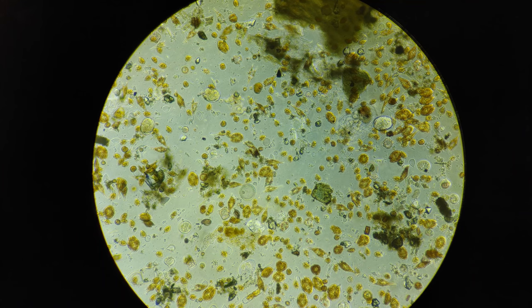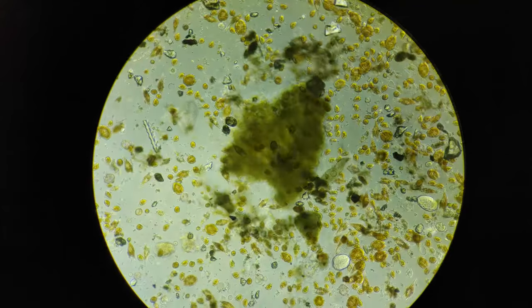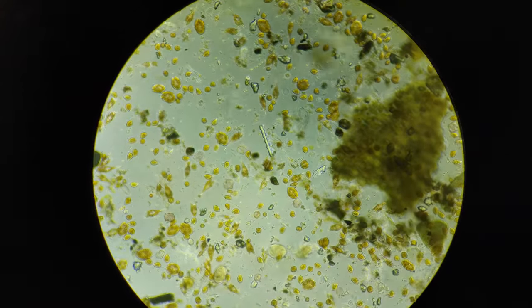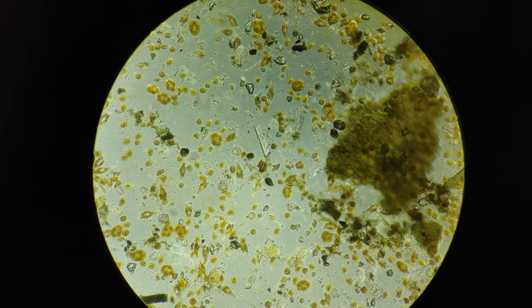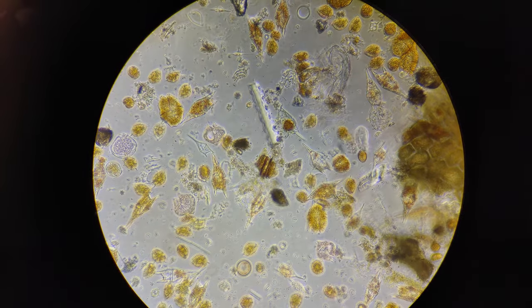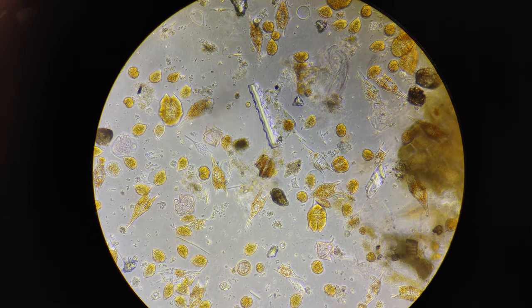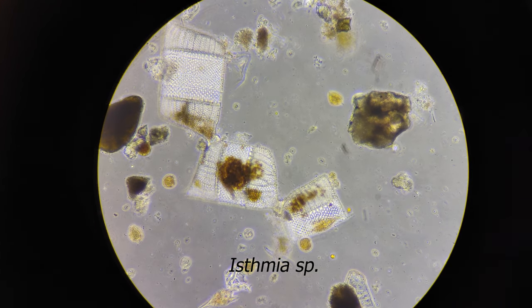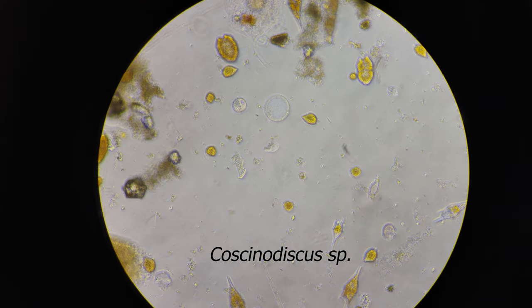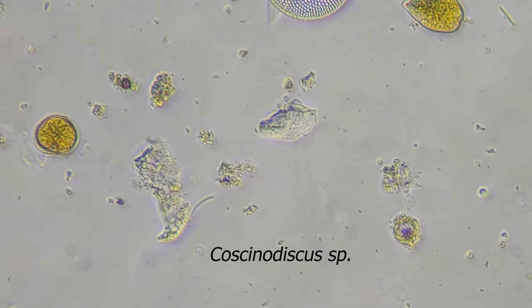This sample actually had much fewer diatoms and more dinoflagellates than I was expecting. Diatoms have a hard shell called a frustule which is made of silica — that's the major component of glass and sand. Diatoms mostly don't move on their own; they're just carried by the currents. Sometimes they're solitary and sometimes they form colonies. They also have a huge diversity of shapes and some of them are really beautiful. Here's a few diatoms — I believe these are in the genus Isthmia. Here's another diatom, this one is a Coscinodiscus. It's shaped like a hockey puck and we're viewing it from the face. You can see as I pull the focus the features become more visible.